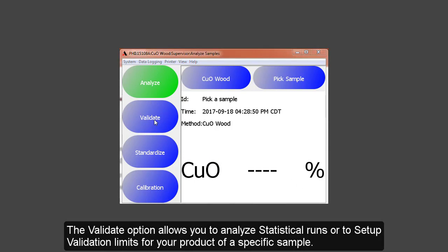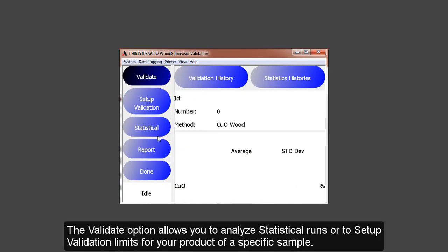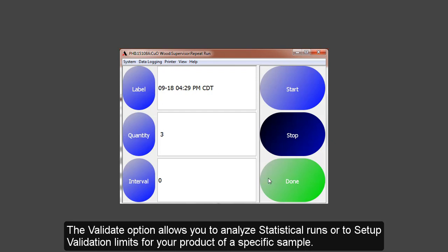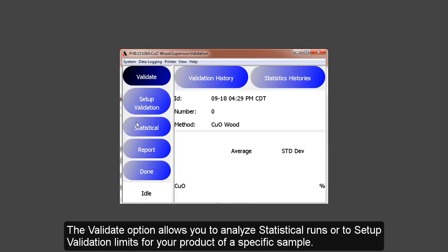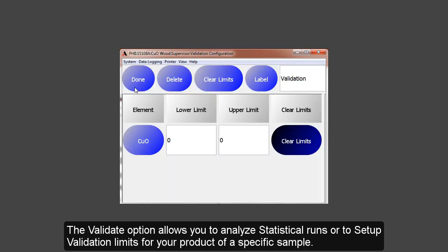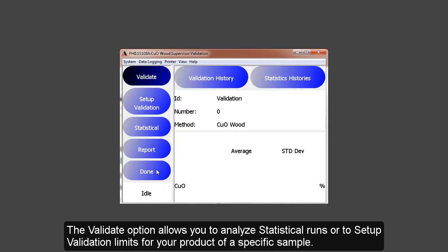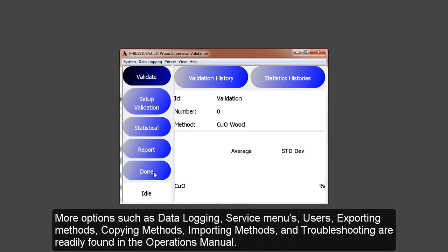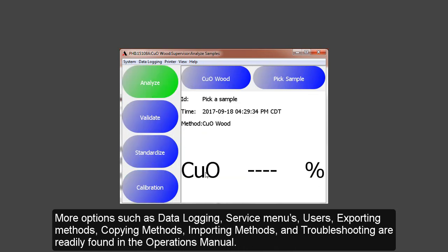The Validate option allows you to analyze statistical runs or set up validation limits for your product or a specific sample. More options such as data logging, the service menus, users, exporting methods, copying methods, importing methods, and troubleshooting are readily found in your operations manual.